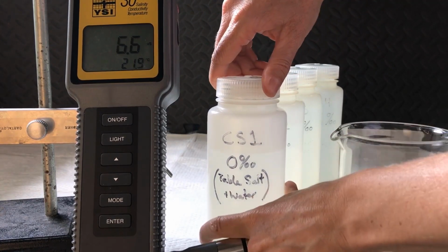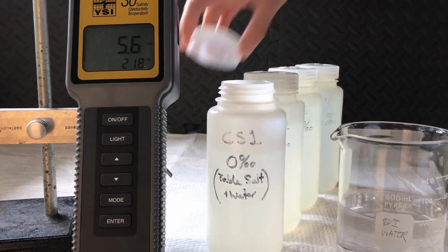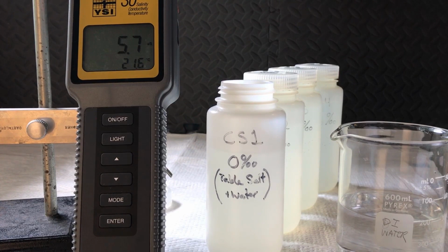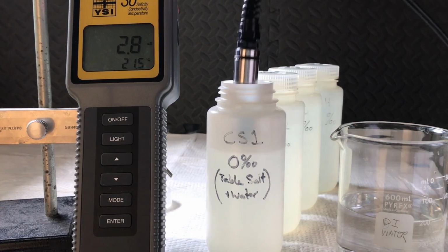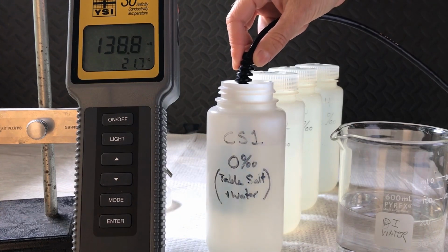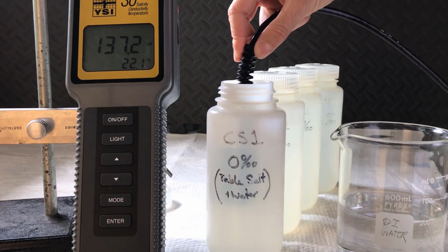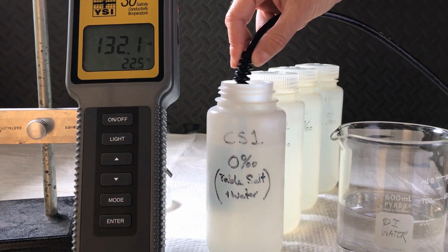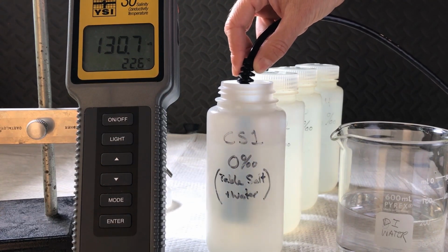The first calibration standard has a salinity of 0 parts per thousand salt. We can anticipate this to stay in microsiemens, and it's basically just deionized water. So I insert the probe into the solution and gently swirl it around until the measurement stabilizes. This can sometimes take a little bit because this is a really small number.